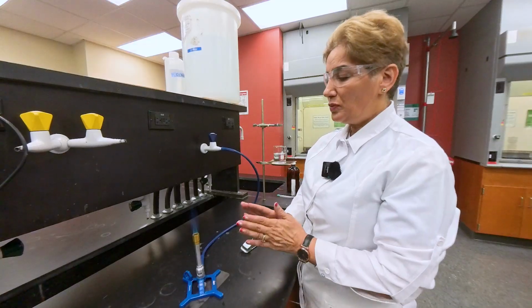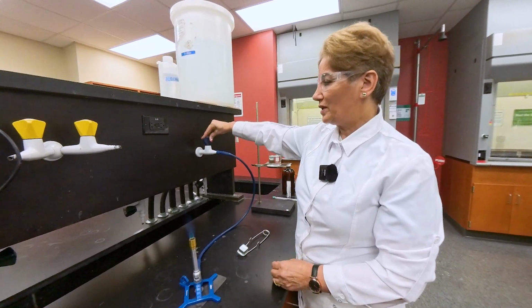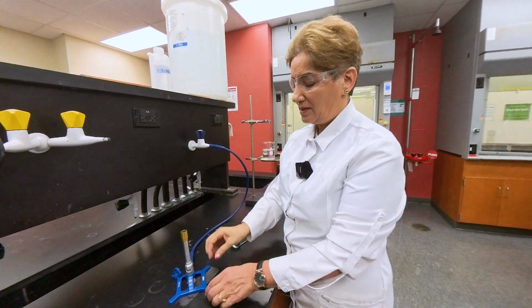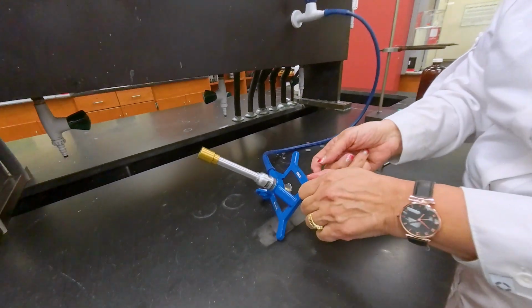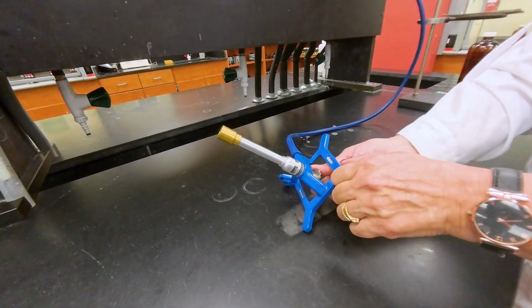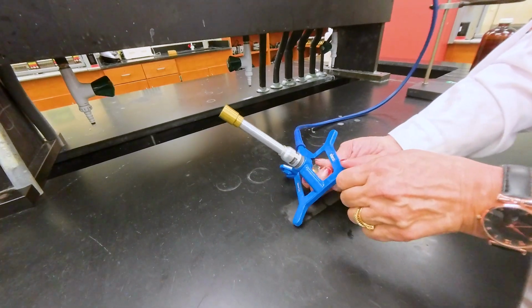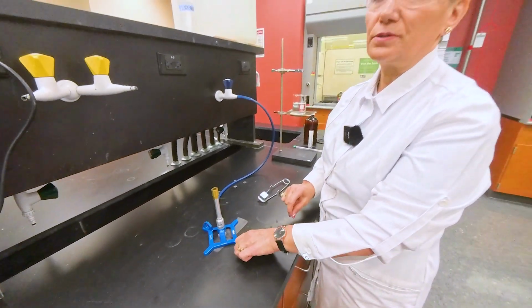And when you are done using the Bunsen burner, the first thing you want to do is make sure that you close the main gas valve. And then you can close the gas adjustment valve or leave it on for the next students, but I always like to start with the closed gas valve because I know how much gas is being added and adjust the level of the oxygen.